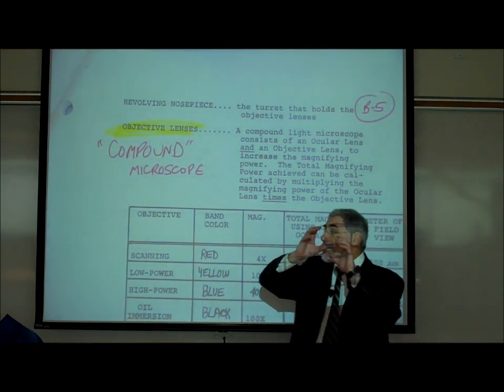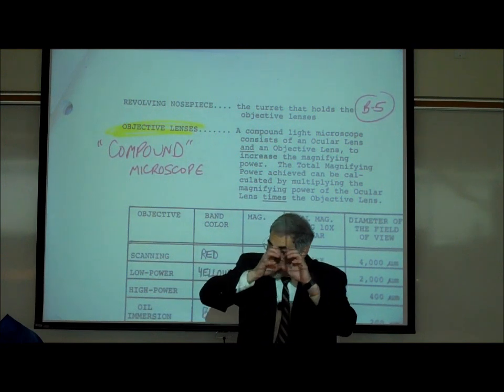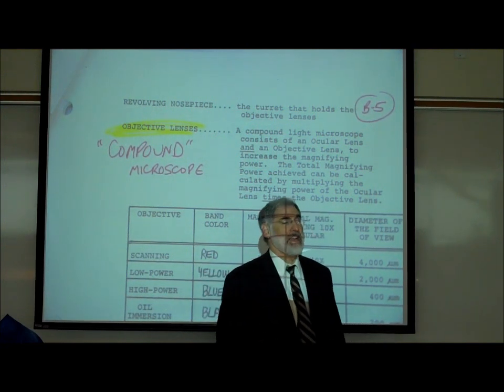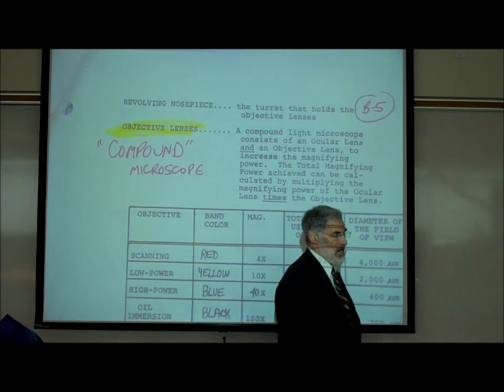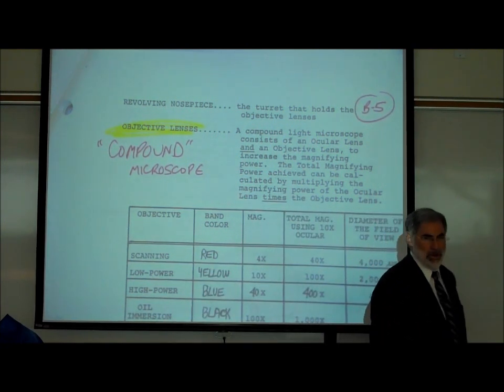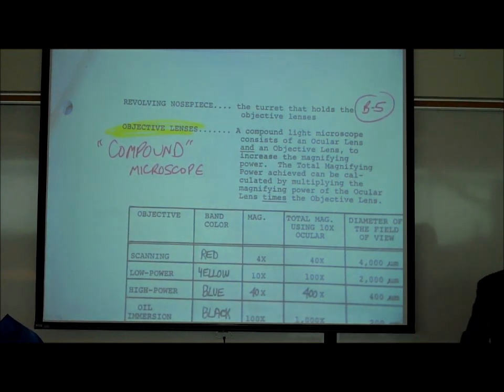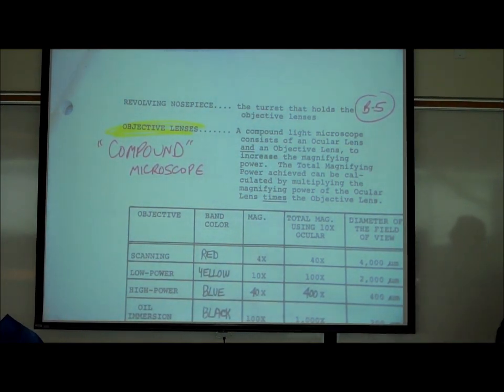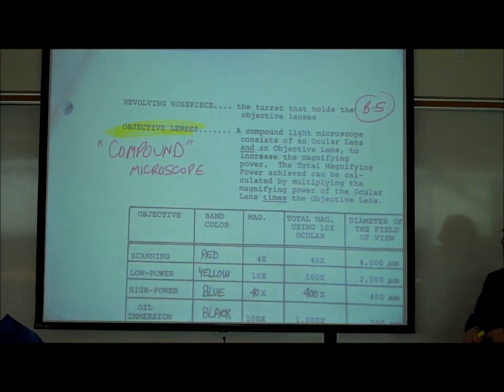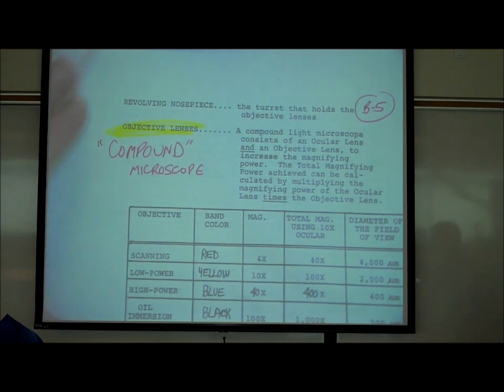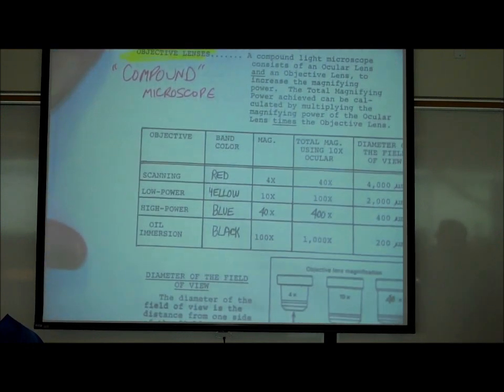The ocular lens magnifies ten times, and the objective lenses also magnify, so you've compounded or increased the total amount of magnification.